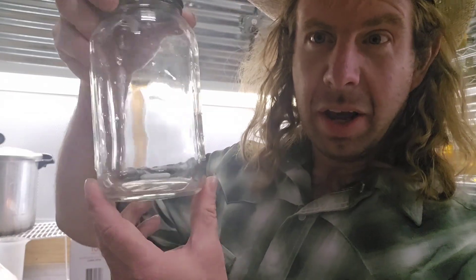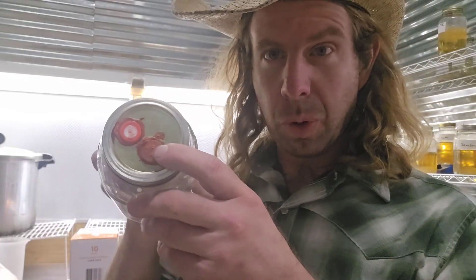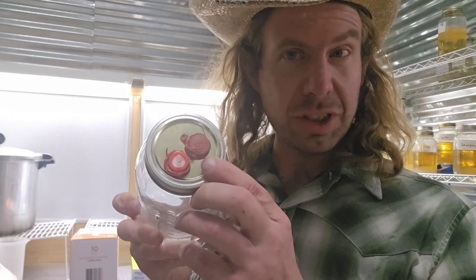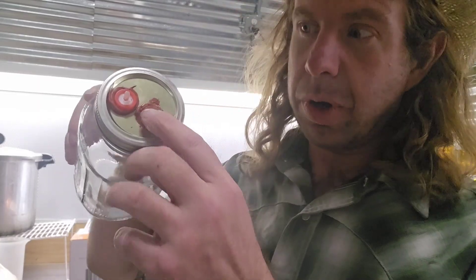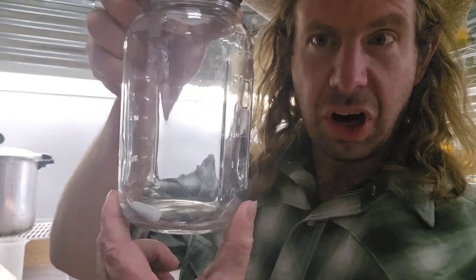Number ten: a liquid culture jar. You need a jar to make liquid culture. You can see I've got the top of this fitted with an injection port and a 0.2 micron syringe filter — there are so many different ways you can set this up. This is a basic liquid culture jar with a silicone injection port, a syringe filter, and a stir bar in it. Number ten: liquid culture jar.